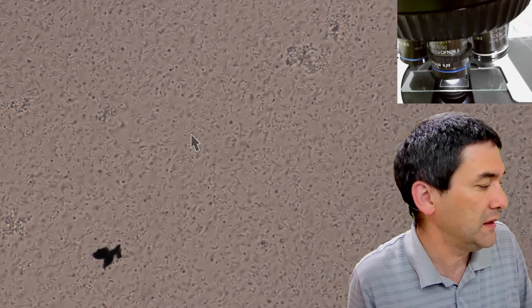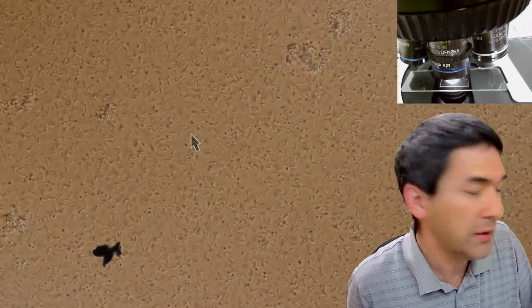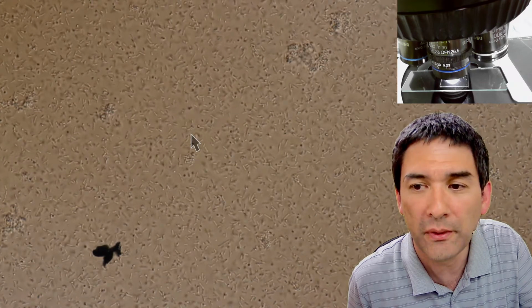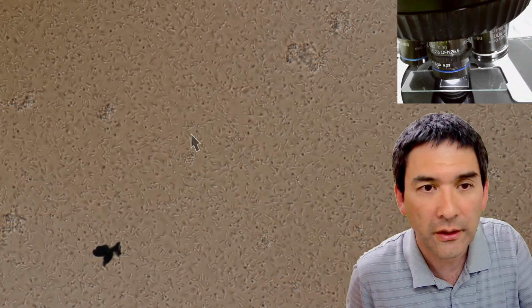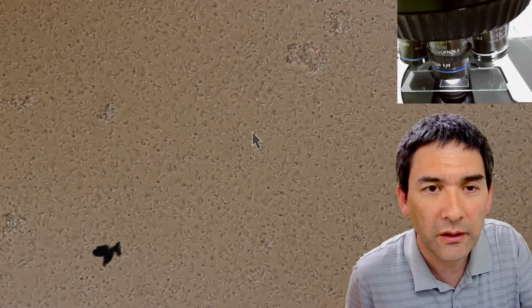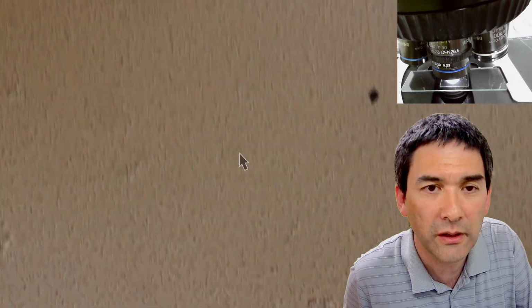I'm going to turn on DIC now, so maybe we have a slightly better contrast. But basically these are now so-called rod-shaped bacteria. They're a little bit longer. Here is the arrow. Yeah, so you see if you look at the individual bacteria over here, they're quite longer, and there are many hundred thousands of bacteria in here right now.